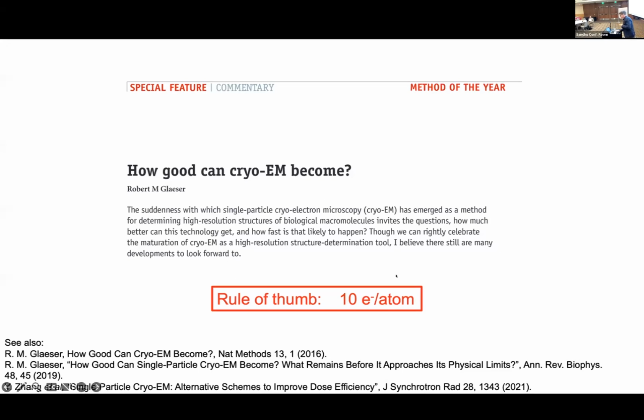And so the rule of thumb is if you get about 10 to 20 electrons per square angstrom in your image before you start to damage or alter your sample irreversibly. So about 10 electrons per atom. Okay. So that's a vision. I'm not going to say I'm going to tackle that, but that's one thing that we could do that would certainly be knowable, is to apply interaction-free measurements to see if we could image a molecule, a biomolecule, without damage here. So that's a vision that Mark Katzevich shared with us earlier.